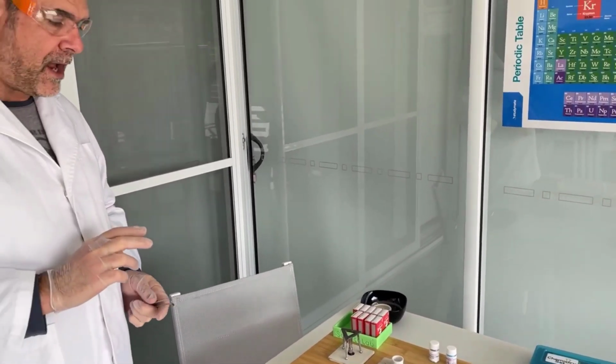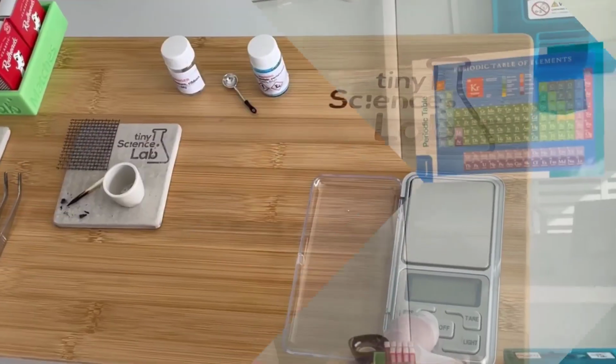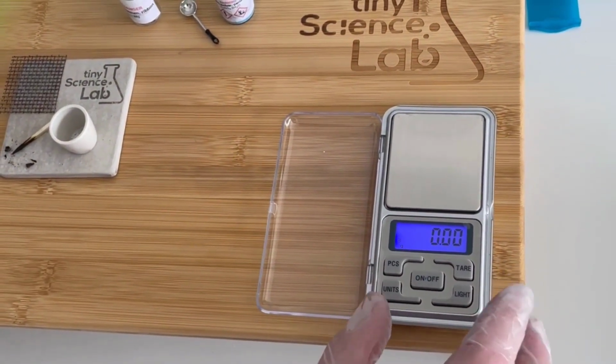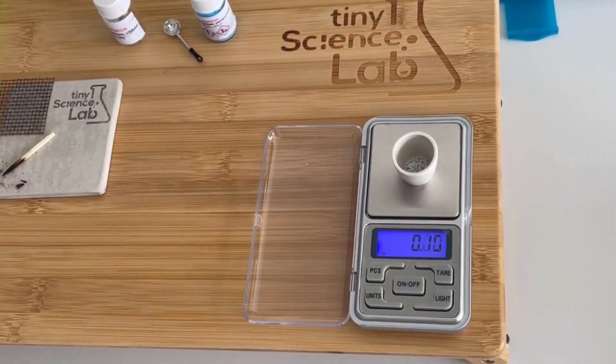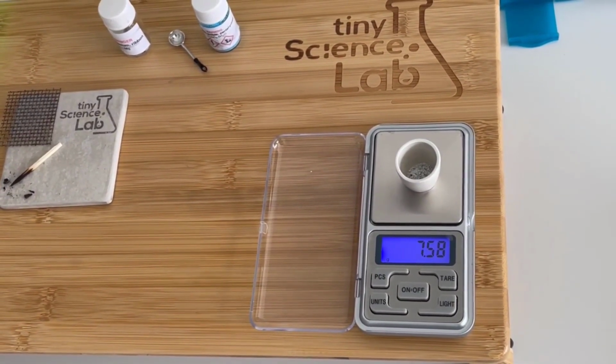So now that we've got a value for the final mass of our magnesium oxide, let's weigh our second attempt at the copper sulfate. Just make sure that I turn my electronic balance on and pop it on. And my value is 7.